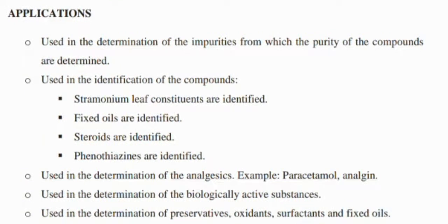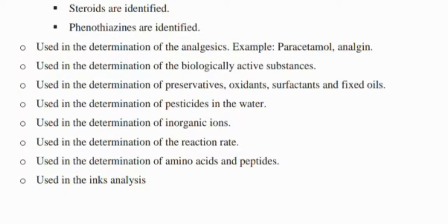At the end, we will see what are the applications of TLC, which include use in the determination of impurities, from which the purity of the compound is determined; use in the identification of stramonium leaves, fixed oils, steroids, phenothiazines; use in the determination of analgesics, biologically active substances, preservatives, oxidants, pesticides, inorganic ions, reaction rates, amino acids, and use in ink analysis.